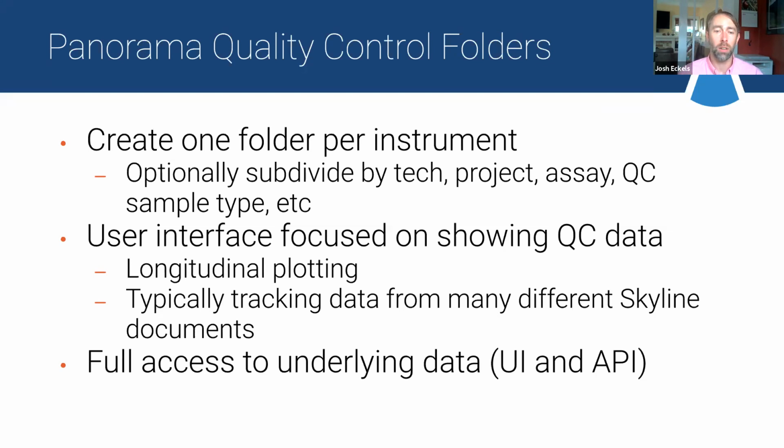So these longitudinal plots, similar to what Lindsay showed, you could do in Skyline, except with a relational database behind the scenes, being able to have an even longer time period that we can visualize and track and analyze. And we can go across many different Skyline files, so you don't necessarily have to have thousands of data points or thousands of different samples in a single Skyline file. You can be uploading them incrementally and then having access to that full data, both through the web interface and through API and other tools if you want to have downstream analysis on it.